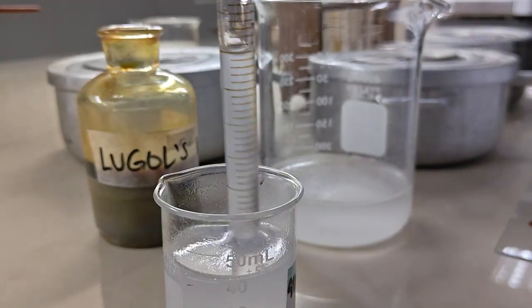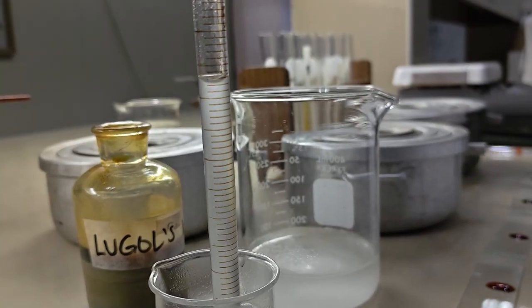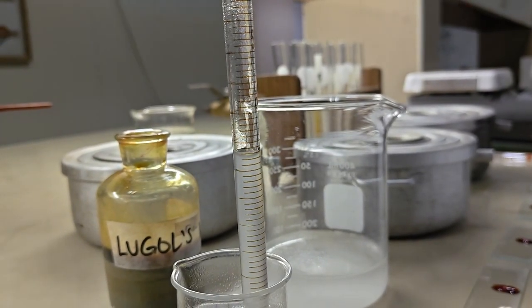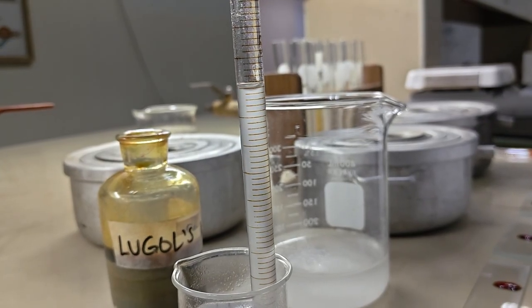Before starting the experiment, the saliva sample was filtered through gauze to remove solid particles. Iodine solution was also prepared on a white surface for easier observation of color changes.